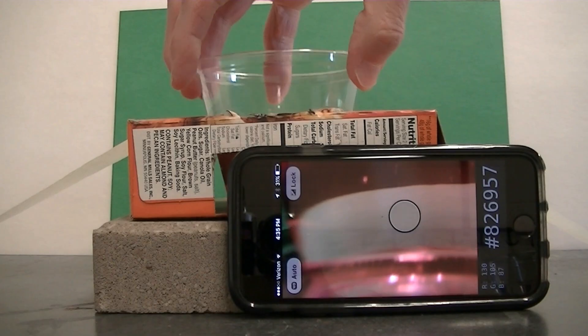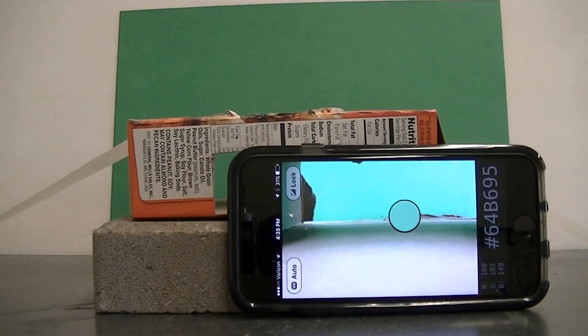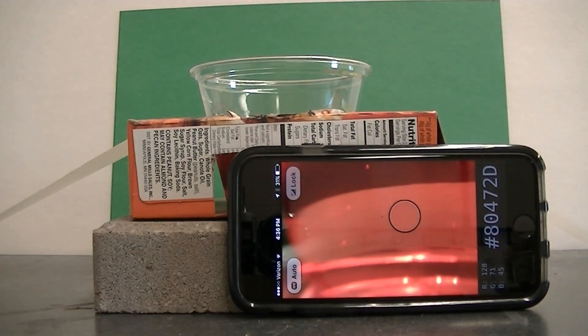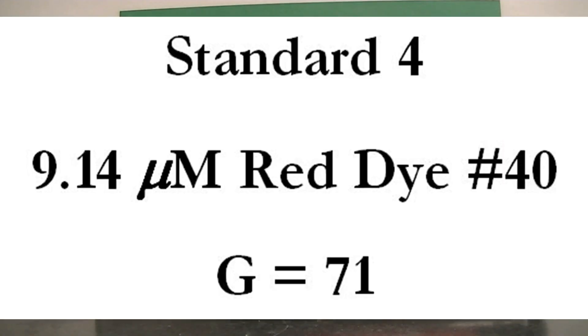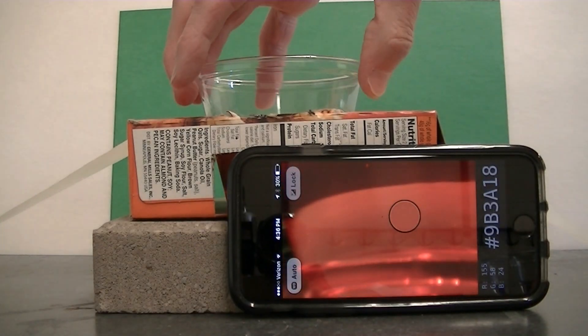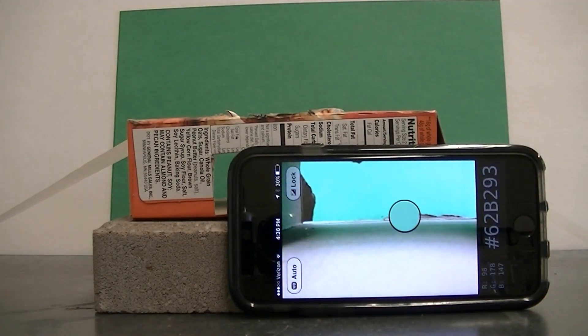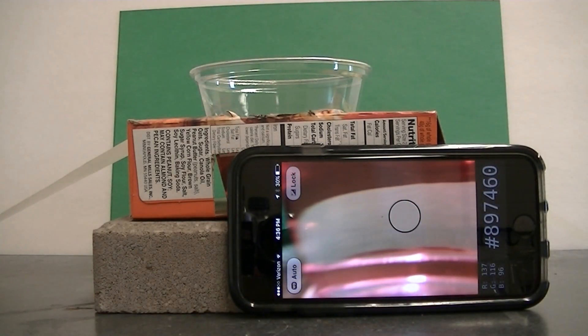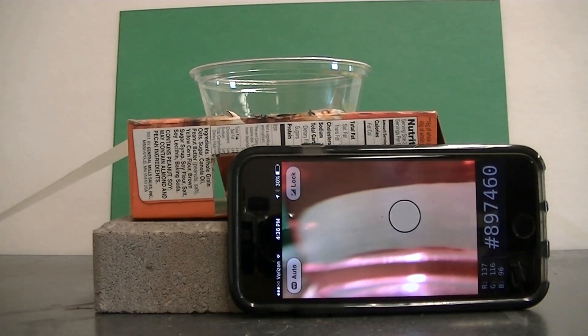And next we're going to measure the green value for a sample that has 9.14 micromolar red 40. And it looks like my green value there has dropped all the way down to 71. Finally we'll test the green value for my unknown. And remember my unknown is just straight strawberry Powerade Zero. And it looks like my green value there is 116.